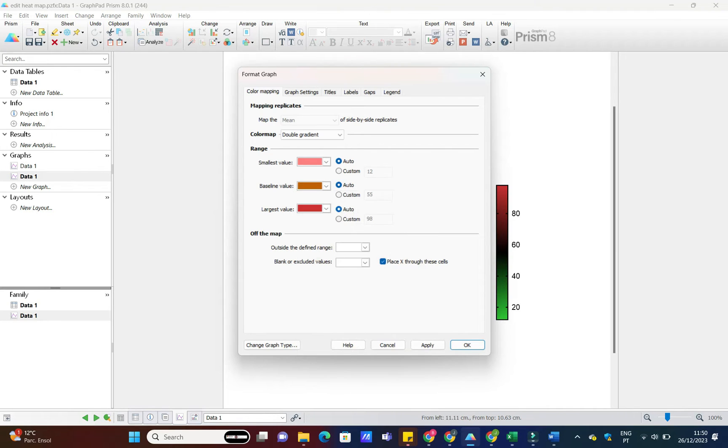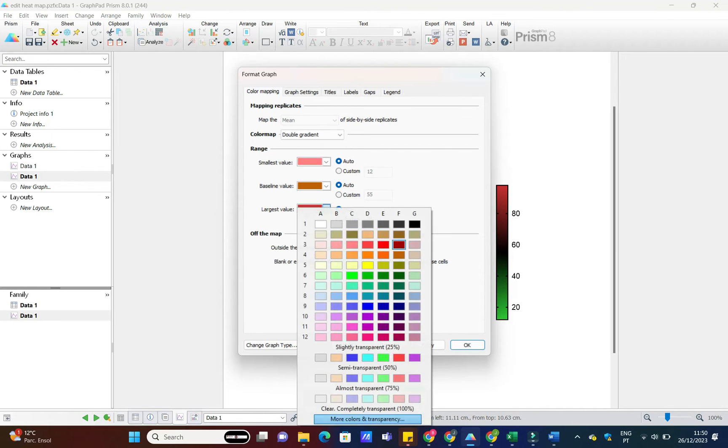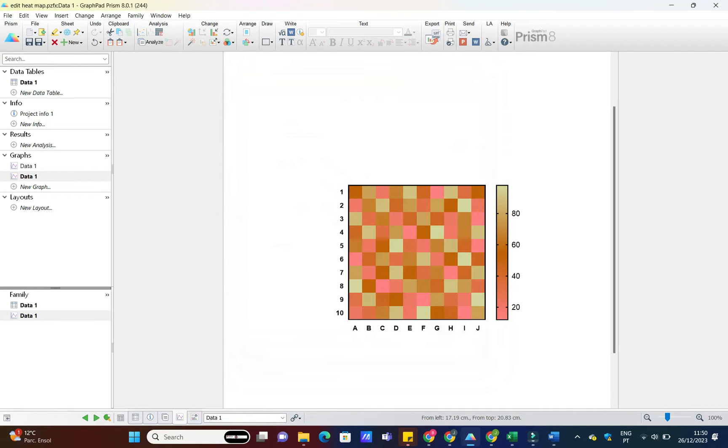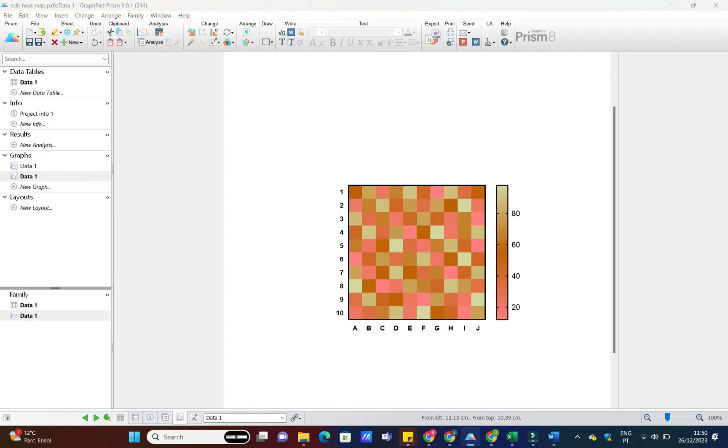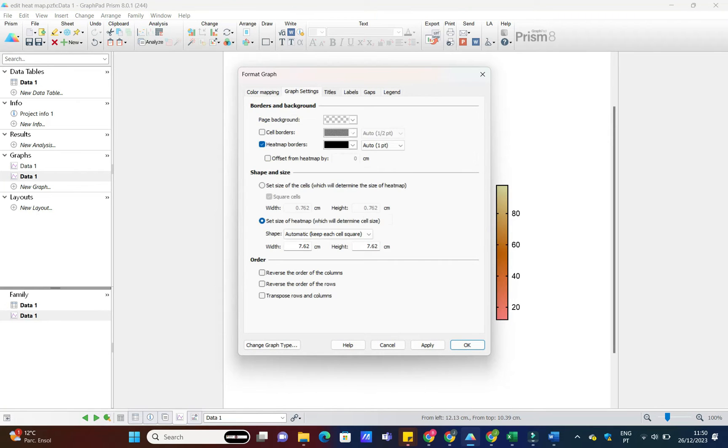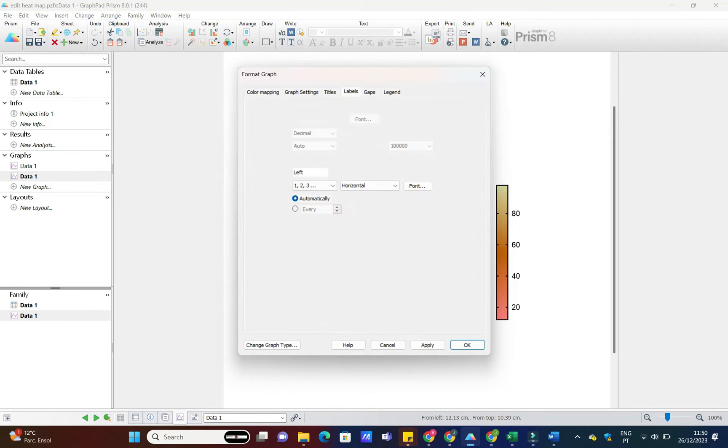A clean and well-labeled heatmap is crucial. Customize your X and Y axes, and don't forget those labels. Go to Graph Settings and tweak the options until your heatmap is not only informative, but also visually appealing.